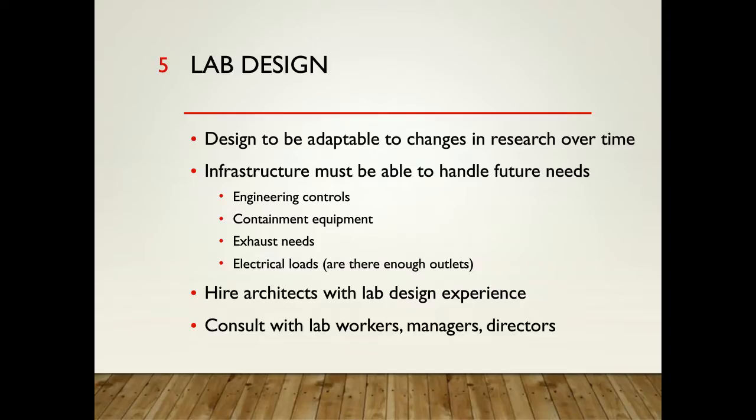And finally, are the electrical loads sufficient? Do you have enough capacity in your electrical system for all of the equipment that's going to be used in the lab space? As labs become modernized, more and more technology gets used, and there are always problems with older labs not having enough outlets and wanting to run extension cords and power strips. And so when you're designing a new space, that's something that should really be looked at: whether you have the existing electrical load and enough electrical outlets for all of the equipment that's going to be moved into the space.